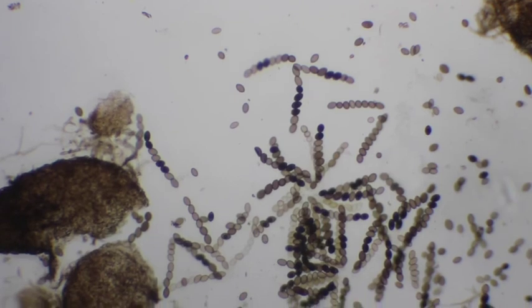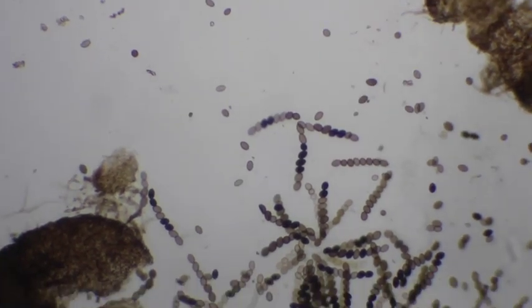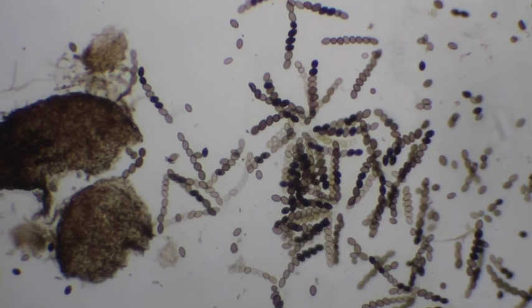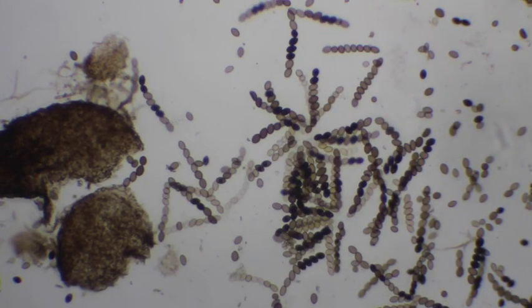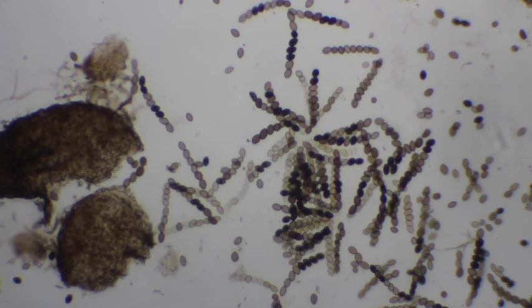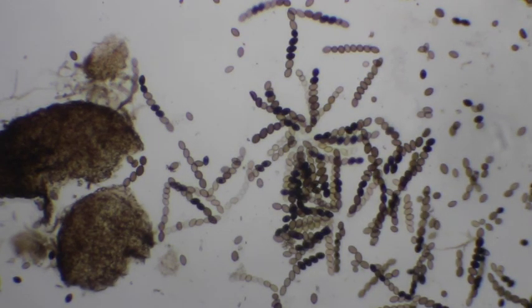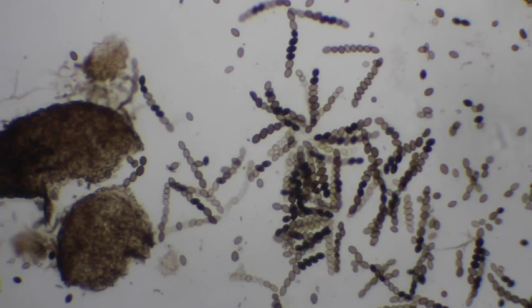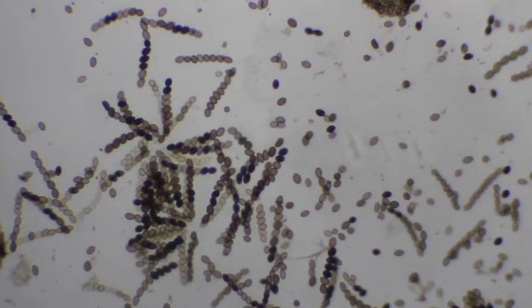Okay, several good ones in this image. Put those right in the center. We can focus in and out. Sometimes further away you can kind of see those colors better than close up as well, but even those 3 right there on top, you can get all 3 of those. The one to the left over there. Okay, and a few of those guys as well. Alright, looking pretty good.